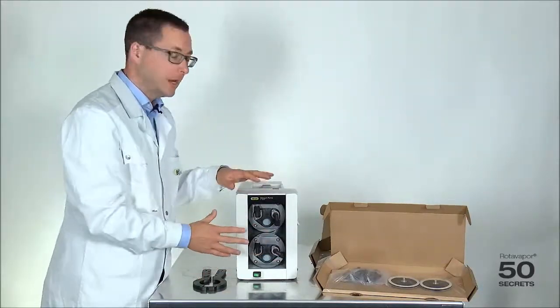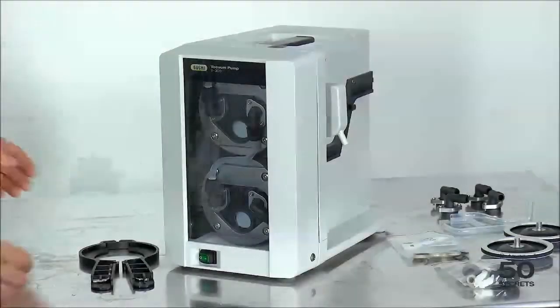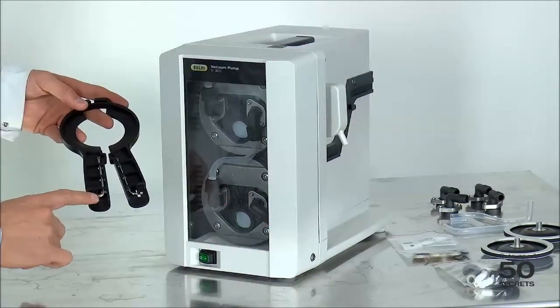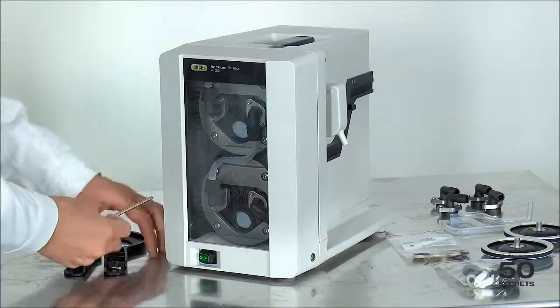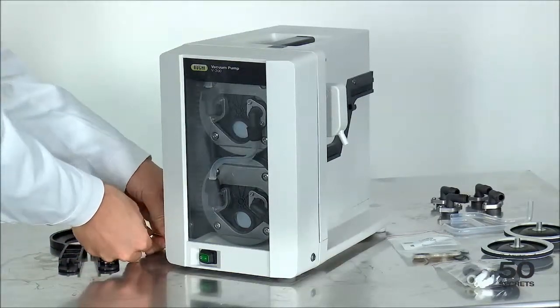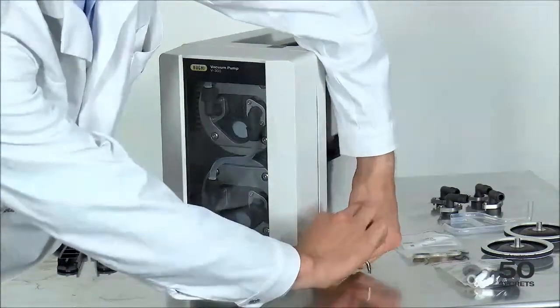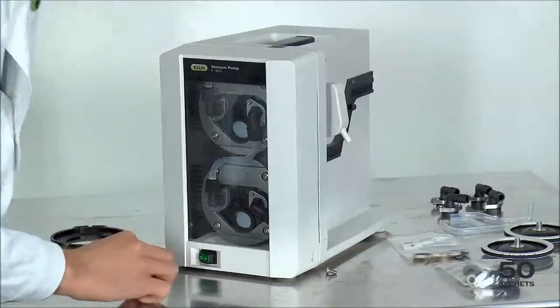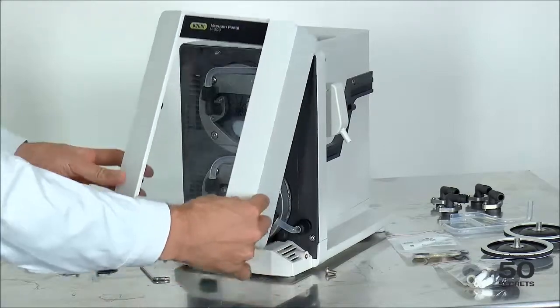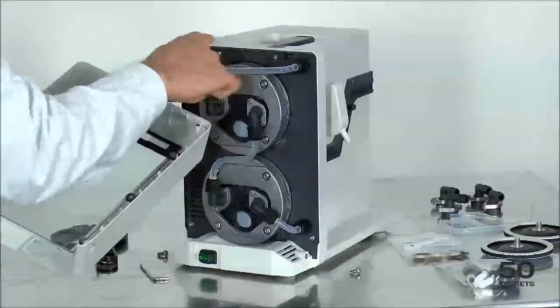Now let me show you in detail how we disassemble the pump and replace the membranes. First we have to open the front part of the pump using the bigger Torx. We open the screws — one on each side. It's very important to first lift this off and only then push it up, because we have some hooks here which fit into that.